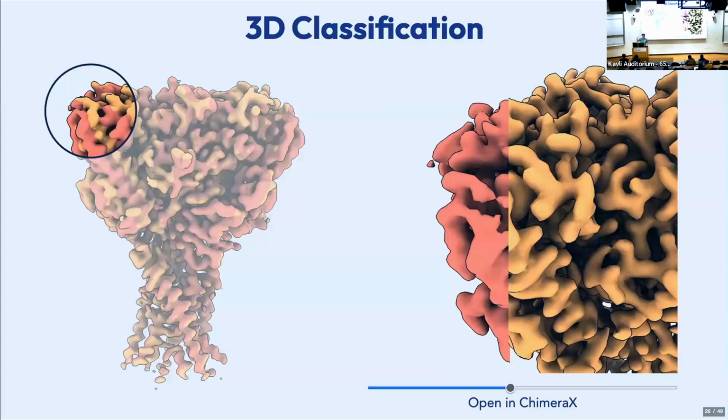So now you have a list of particles, and each of those particles, you've checked all 3 orientations based on the symmetry expansion. Does it have ligand or not, right? So then let's say you go through, use CryoSPARC tools to count how many times this particle is in the yes ligand class and how many times no. So now you have, for every particle, this particle had 1 time it ended up in the yes ligand class and 2 times it ended up in the no ligand class. That tells you that 1 of the positions has ligand and 2 don't, theoretically, right?